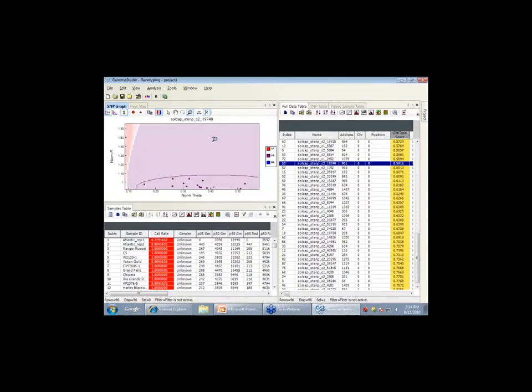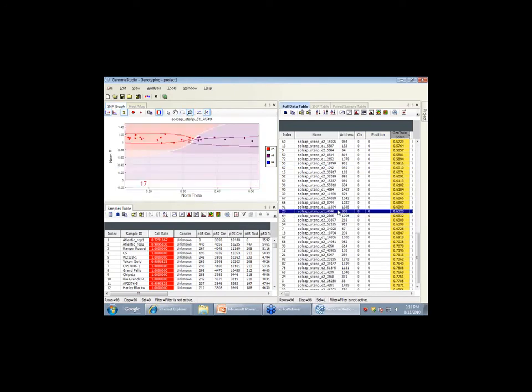And so on. Okay, I want to zoom out. To get back, you can just hit these guys. This optimizes your screen horizontally, this optimizes it vertically. If you want bigger or smaller dots, you can do smaller dots, bigger dots.